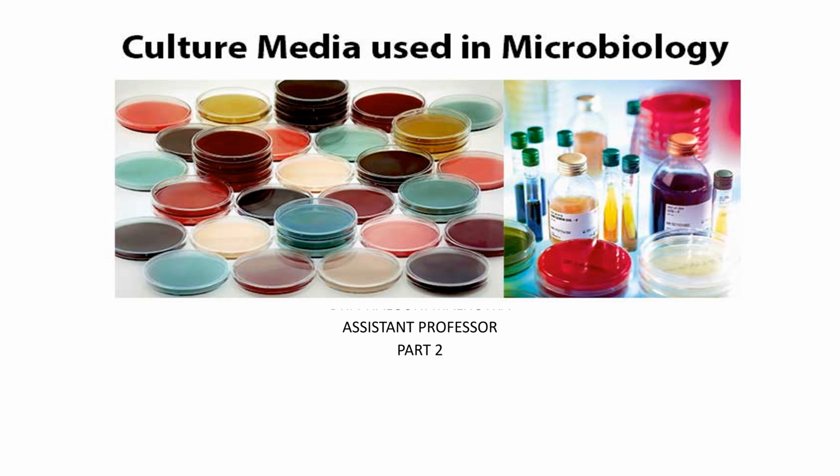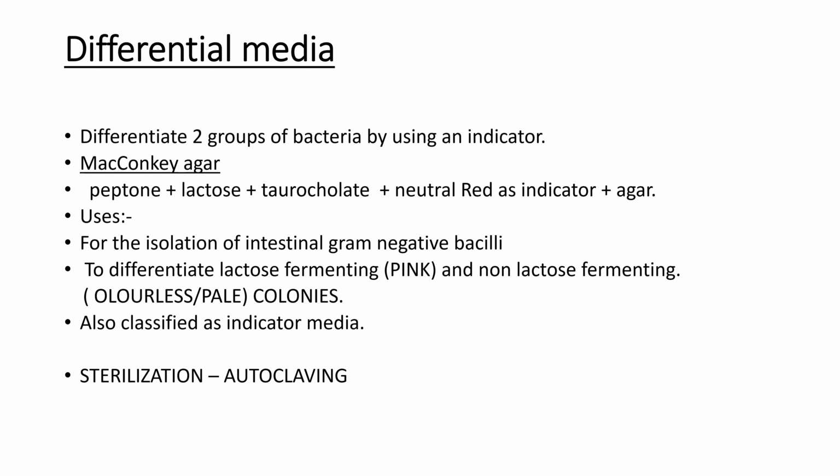Hello students, so this is the culture media topic, and it is the second part, which is continued. Now is the differential media. Differential media means it differentiates two groups of bacteria by using an indicator.